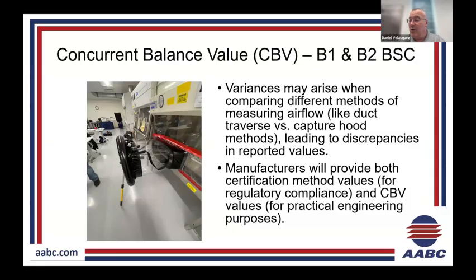So, B1s and B2s. Poll question number 5. This is a good one. I'm sure the senior guys will probably have come across this. Have you ever been on a project that you balanced where you have everything balanced, but then the certifier comes in and fails a BSC for low exhaust flow?